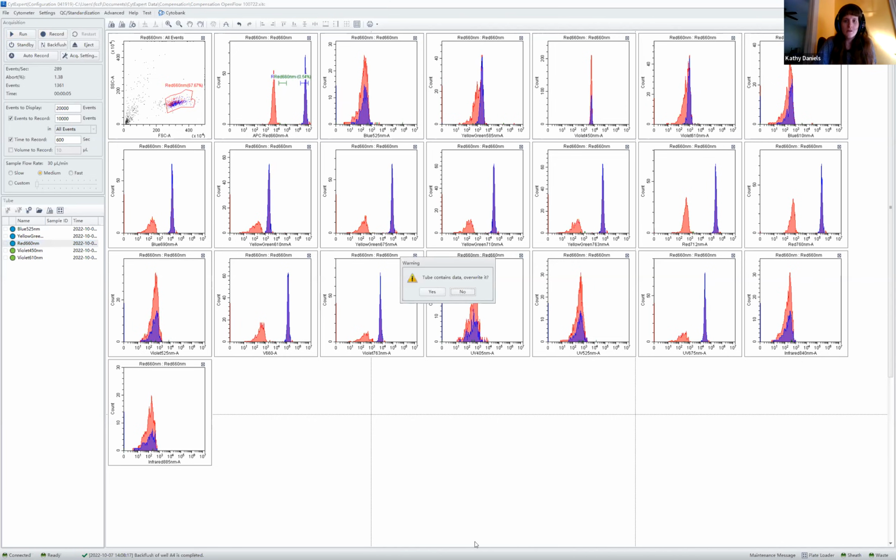Okay, I see a question in the Q&A. Yeah, I was planning to answer, but we can answer it live. Ezra was just asking about the red and blue peaks that you show there.